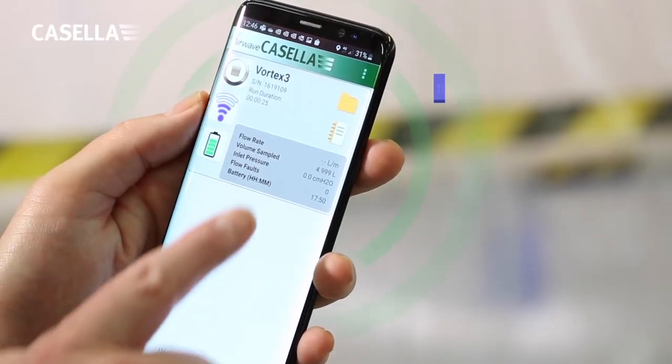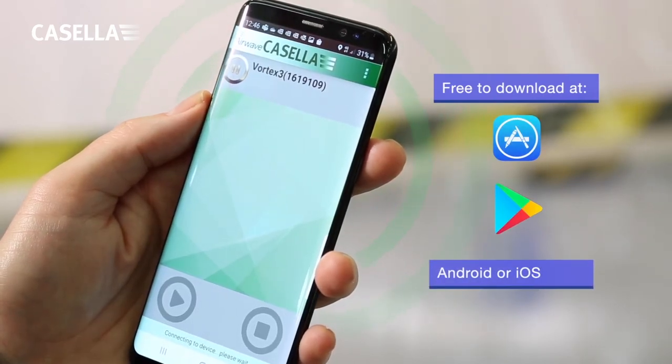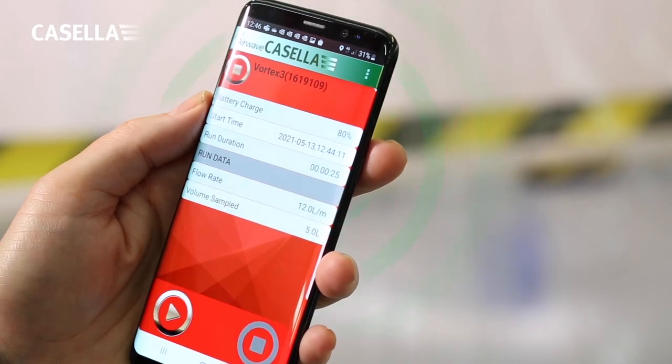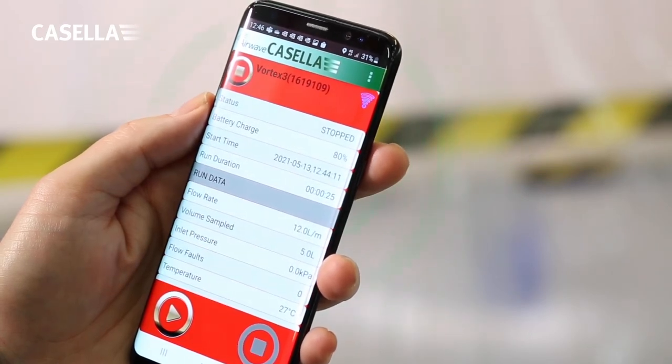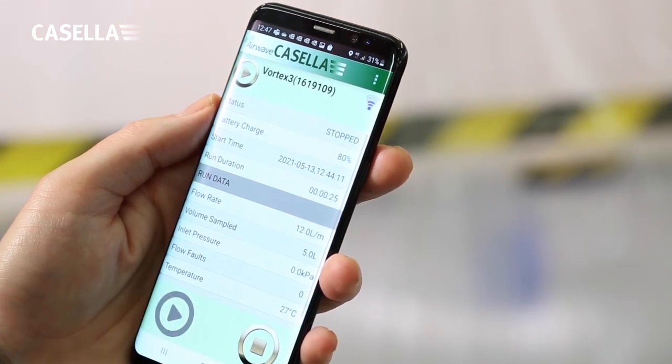When the Airwave app software is first opened, it automatically scans for Airwave compatible products within range. The Airwave software allows you to control and check the pump's status and measurement progress without having to enter a potentially contaminated area.